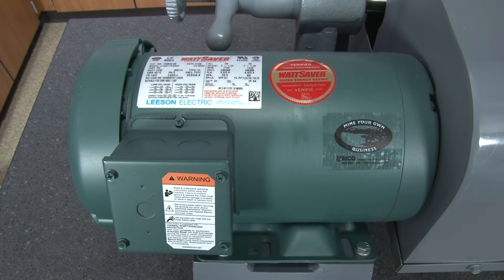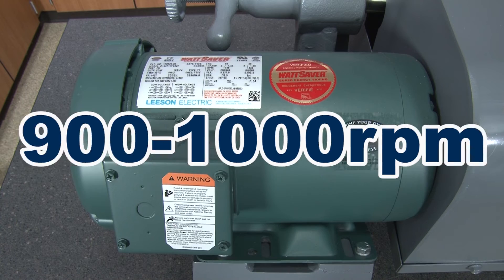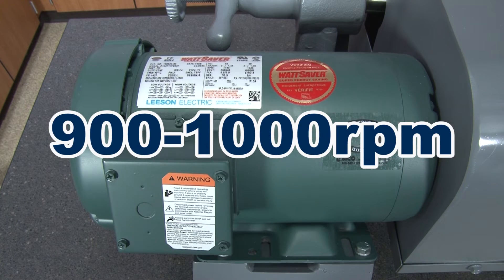A 2-horsepower motor rotates the shaft at 900 to 1000 RPMs through an enclosed double V-belt drive.